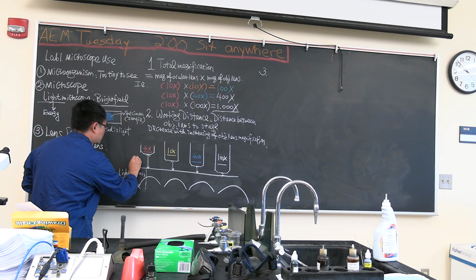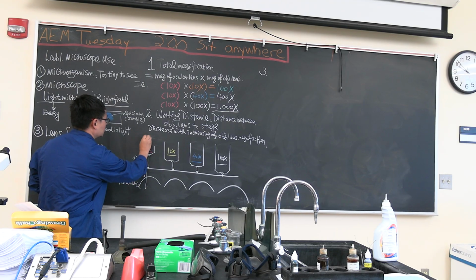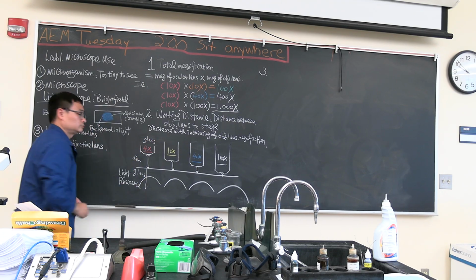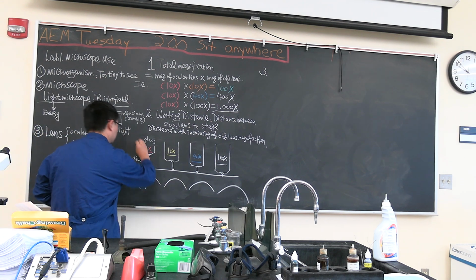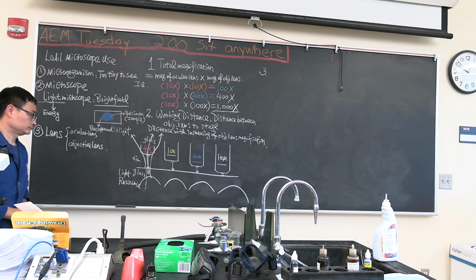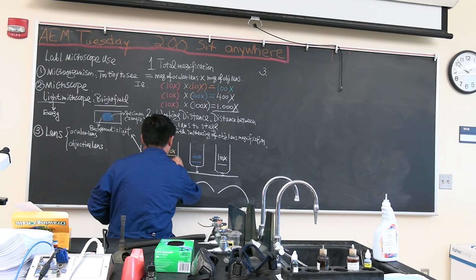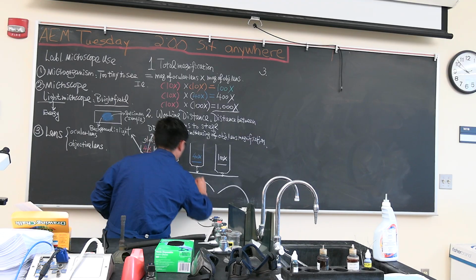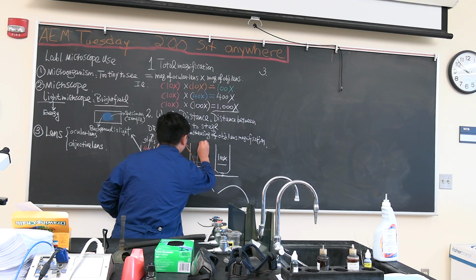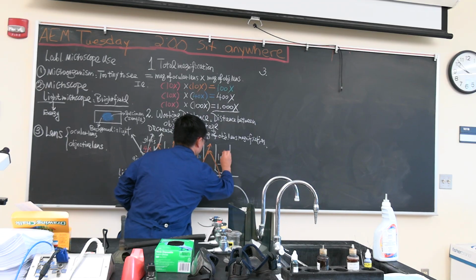This area is air. This area is glass again. So what will happen? The same thing will happen, like this, like that, like this. More fuzzy.